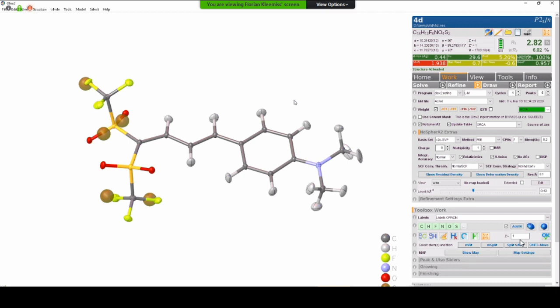If you have some really, really heavy uranium or something, we have to wait for theory to catch up with that, because we need all electrons. If you imagine that we do a Fourier transform of the electron density of your atom and there's effective core potentials, we cut out the electron density of your core, but the electron density of your core is actually quite important for the scattering of that atom. And if it's not there, you cannot describe the atom properly. So we need all electron basis sets, and this is why we have to stick with these X2C basis sets.